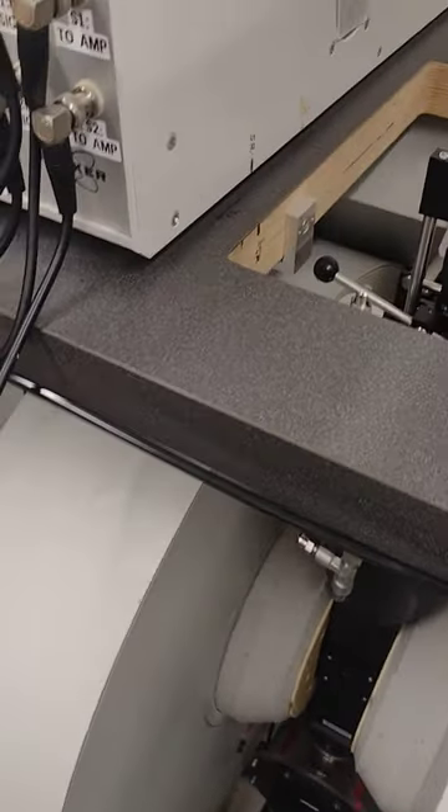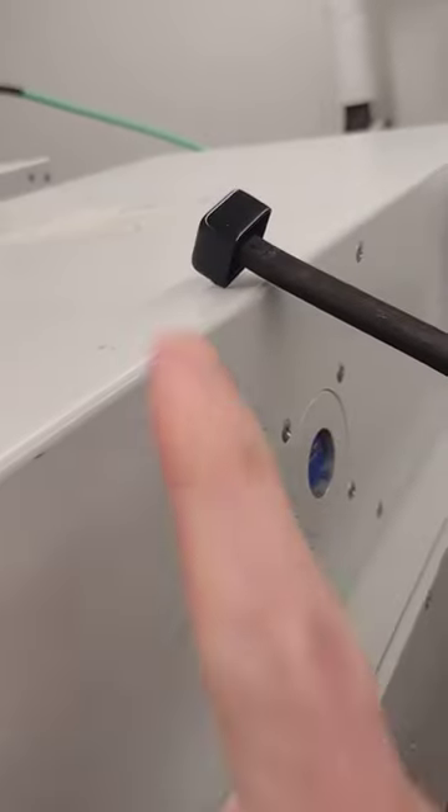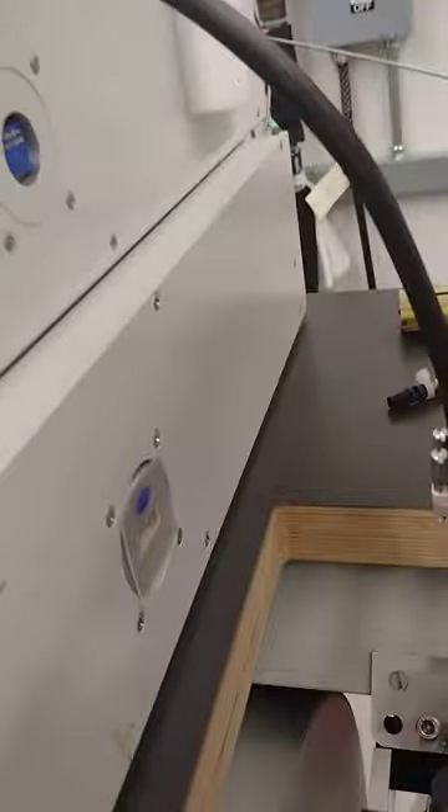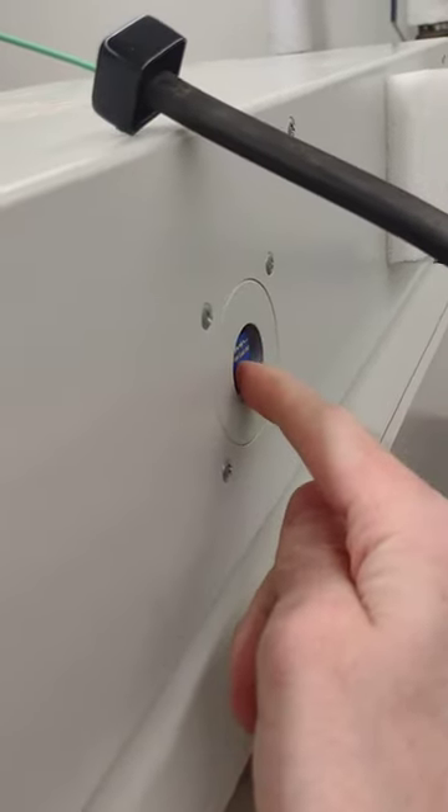The next step is to remove the resonator from your Crystap body. I have already disconnected the resonator waveguide — the flexi waveguide — from the Q-band bridge connector.